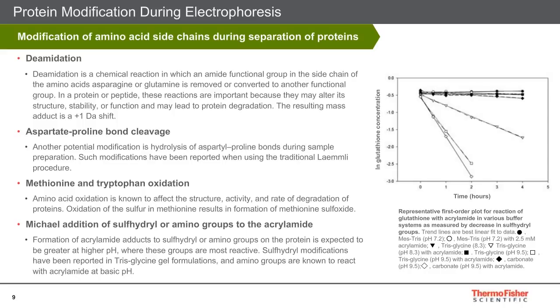Now, the reason why gel operating pH is important is because pH plays an important role in protein modification that can happen during electrophoresis. The precast gel and its buffers are not really an inert environment as sometimes perceived. The electrophoresis process can result in modification of your protein of interest, which can have impact on downstream applications following electrophoresis.